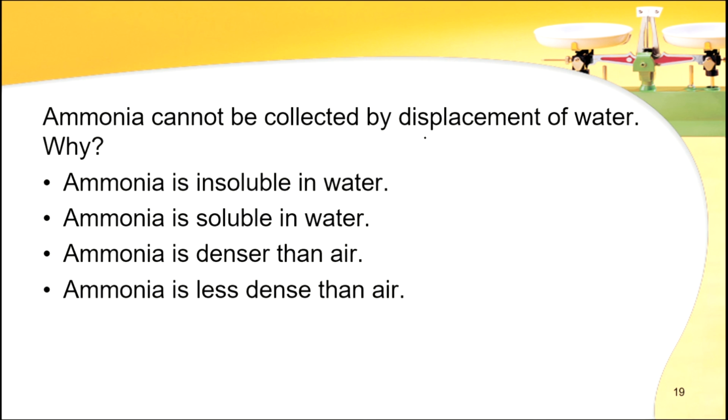We can use displacement of water if the gas is insoluble or slightly soluble. But we cannot use displacement of water to collect ammonia. It is only for insoluble or slightly soluble gases. So it means ammonia is soluble.